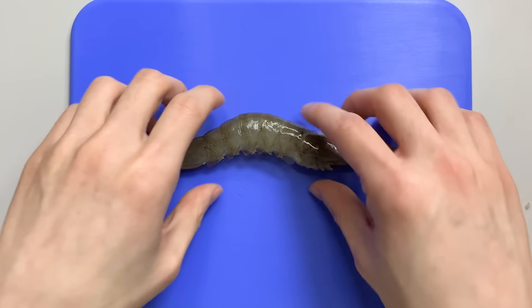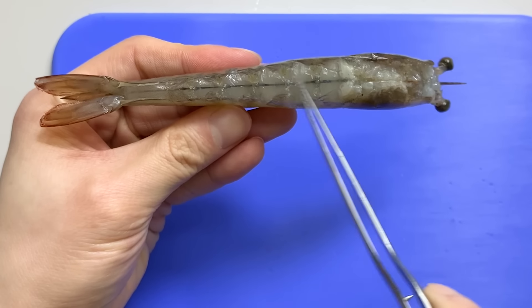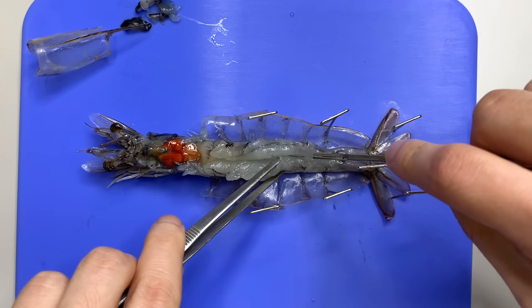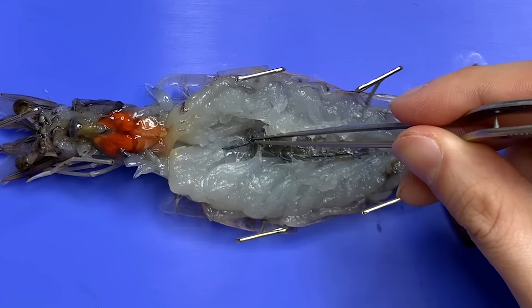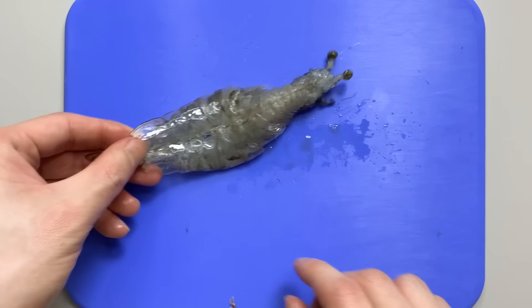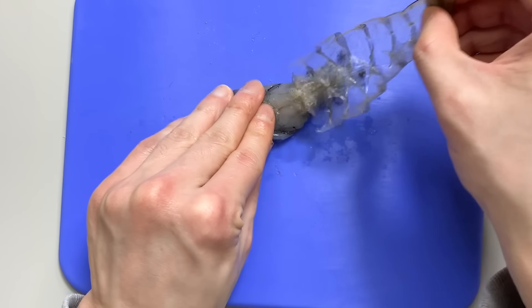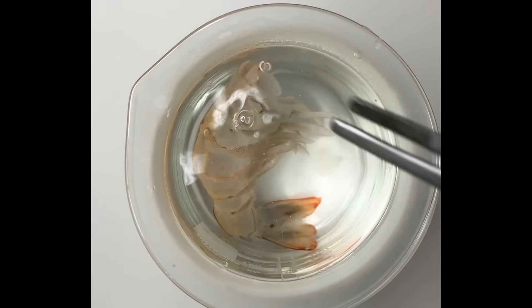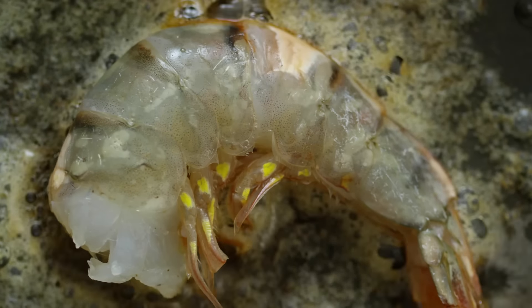If you cut the top of the abdomen and open it, you can see the intestines. The intestines are connected to the tip of the tail, and the anus is located at the bottom of the tail. Lastly, if you look at the bottom, there's one line — this is the ventral nerve. If you carefully split it from the back, you can see the ventral nerve clearly.